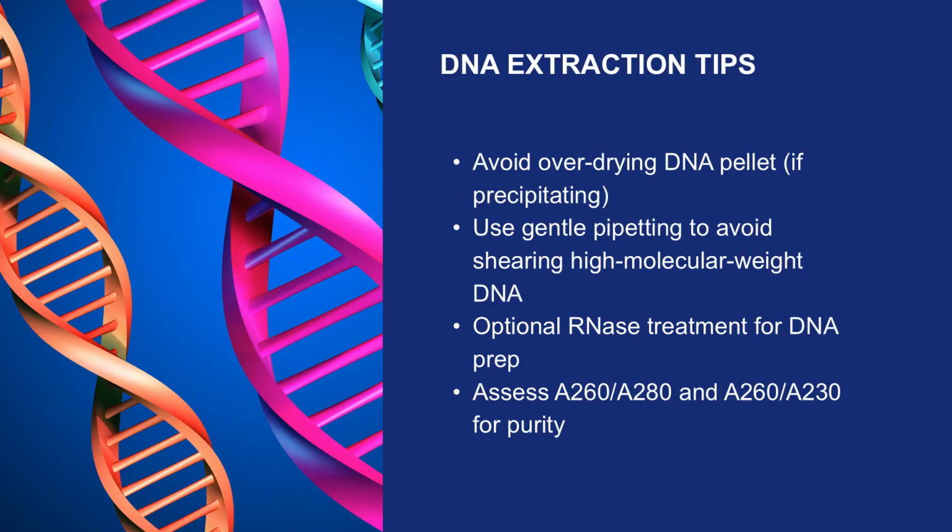For DNA, it's important to avoid mechanical shearing, so pipette gently and minimize vortexing. Avoid over-drying DNA pellets, which can make them hard to dissolve. Treat with RNase if you need DNA free from RNA contamination. Check your purity with A260/A280 and A260/A230 ratios to ensure you're working with high-quality DNA.